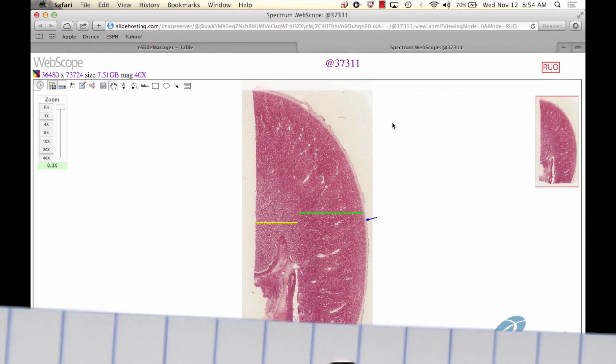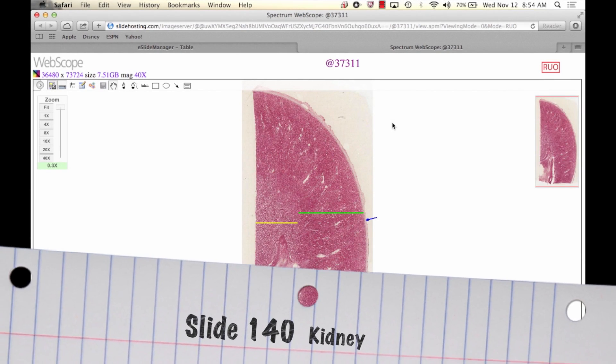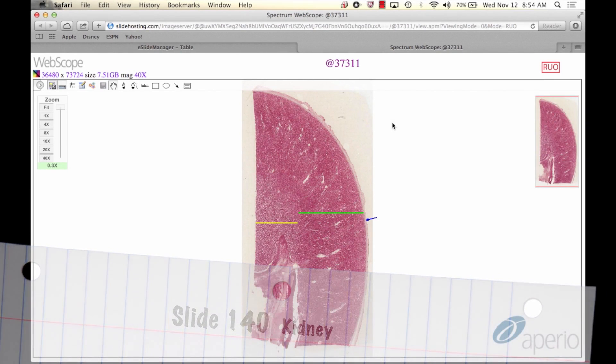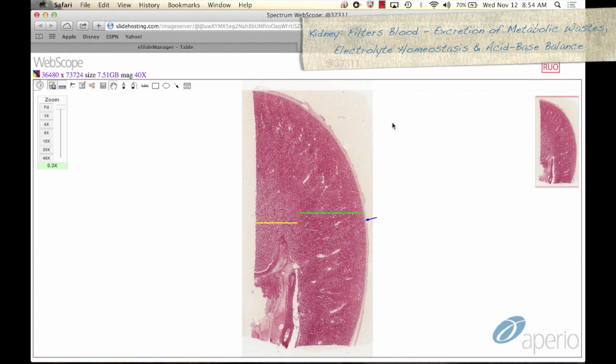We will start today with slide 140, which is a section of kidney stained with H&E. The kidney is the first part of the urinary system and functions to filter the blood for the purpose of excretion of metabolic waste. It is also crucial for water and electrolyte homeostasis and acid-base balance.